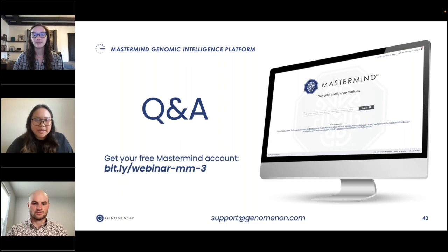Awesome. Sort of related to that, Betty, another question for you. Is the team continuing to curate more genes beyond what we have already done with the clinical exome? Yeah, excellent question. So the clinical exome is a pretty loose term depending on who you ask. And so we definitely have goals to go beyond that. On one hand, we could say we've already reached the clinical exome, and since we're still continuing curation, we're definitely on the path to curate as much available information as there is out there regarding publications and what we can find. We definitely have not hit the limit of information out there that we can curate.